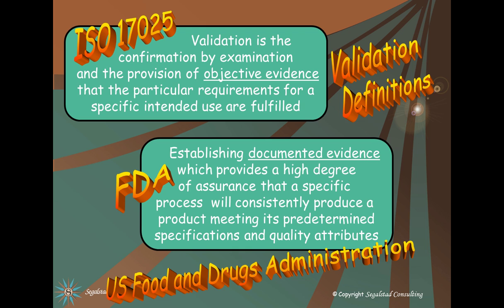The validation definitions are slightly different from different standards. The ISO 17025 says that validation is the confirmation by examination and the provision of objective evidence that a particular requirement for a specific intended use are fulfilled.